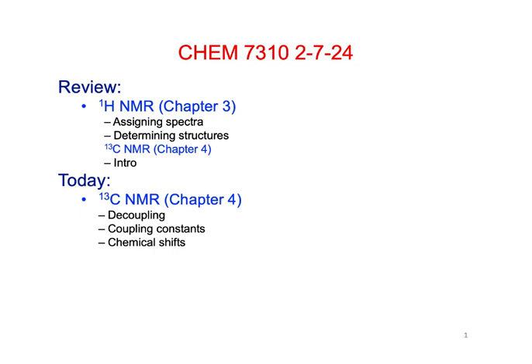And we talked about the fact that C13 NMR is much less sensitive for two main reasons. One, there's a very low natural abundance of C13. Of course, you could get around that if you synthesize compounds and put in a C13 label, and people do that kind of thing.